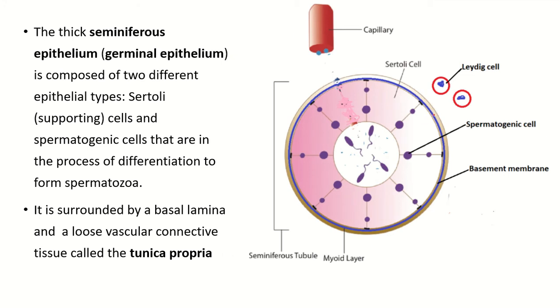Now we discuss the single seminiferous tubule. This is the basement membrane. On the basement membrane, Sertoli cells rest. This is the nucleus of the Sertoli cell — light stained nuclei with prominent nucleolus, and the shape of the nucleus is oval or triangular. The Sertoli cell holds the spermatogenic cell, which is the most numerous cell of the seminiferous tubule.